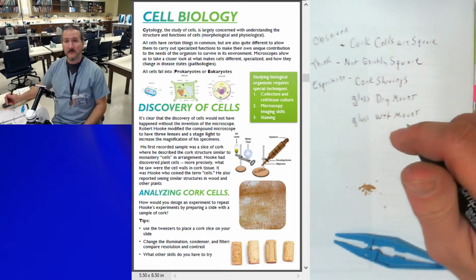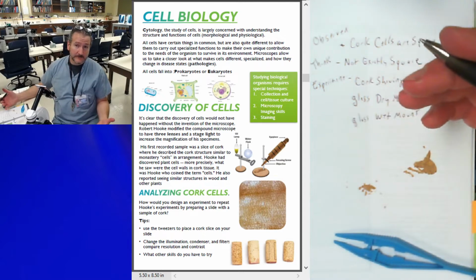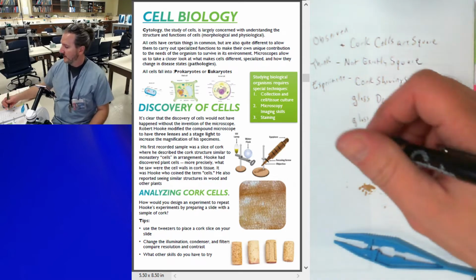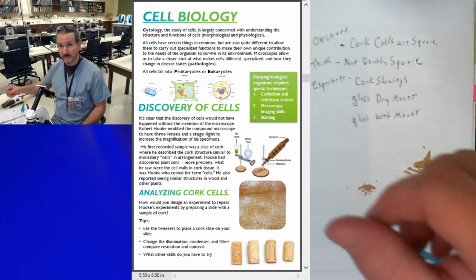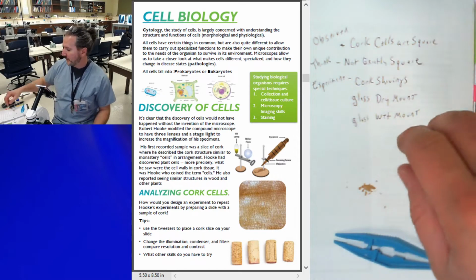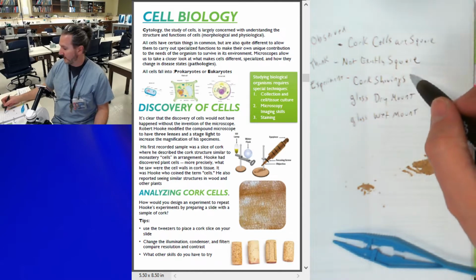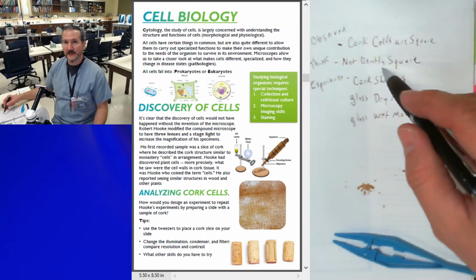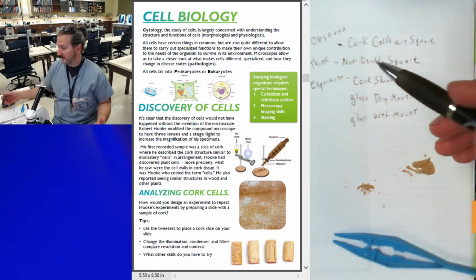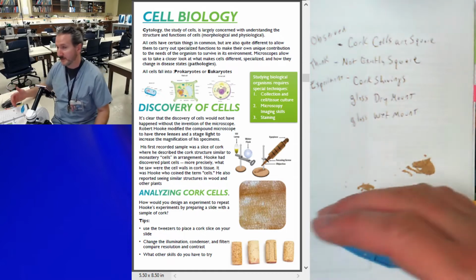If you want to get crazy, you can add some stains to it. Put a little methylene blue, put a little bit of iodine. Will they work? Well, methylene blue binds to proteins basically, and iodine likes cellulose, carbohydrates. Which one would you probably use in this situation? You predict. So that might be your next experiment. Once you find out if they're exactly square or not, repeat it, but we're going to say that methylene blue binds to the proteins, and we'll be able to see what inside. Or we'll try with iodine. Iodine binds to carbohydrates, so it'll bind to what inside, make it stand out.